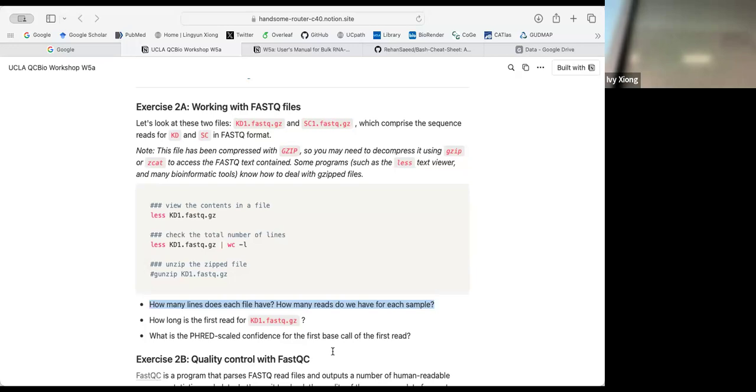Yeah, so that's going into the data folder. So you want to specify. Okay, and here, so now you're in the data folder, so you can do ls. Okay, now here we go. Yeah, so now you can see the content, right?